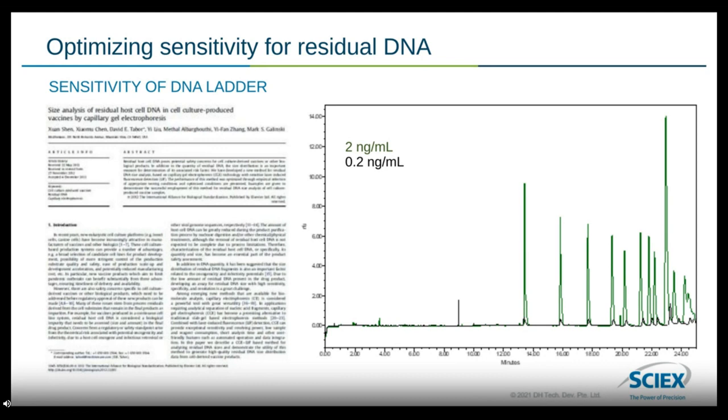They explored ways to increase sensitivity by focusing on using different dyes, optimizing their sample matrices, optimizing their injection parameters, and even looking at the dye concentration to reach what was previously unheard of levels of sensitivity. Because they were able to achieve an LOQ of 0.025 nanogram per mL using the standard. And they were even able to identify the same 10 ladder peaks at 0.00625 nanogram per mL. And that is amazingly sensitive. That is great work by that team.